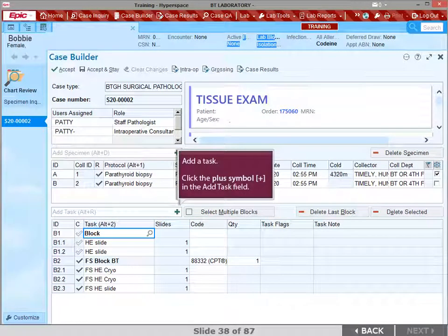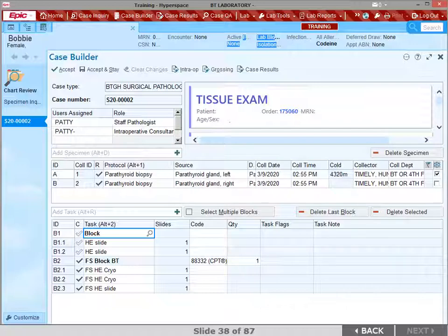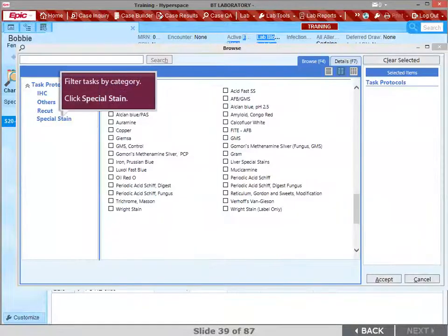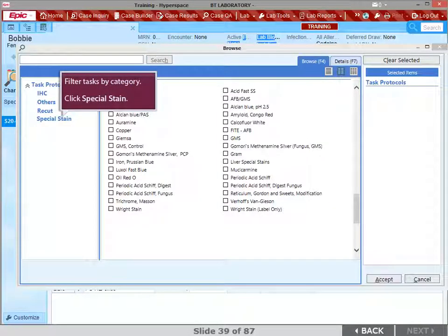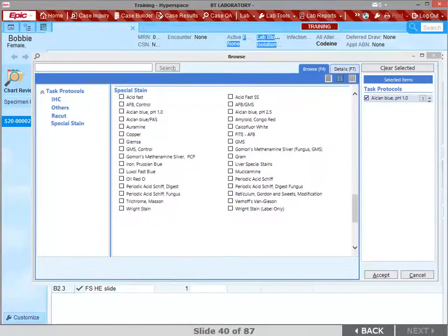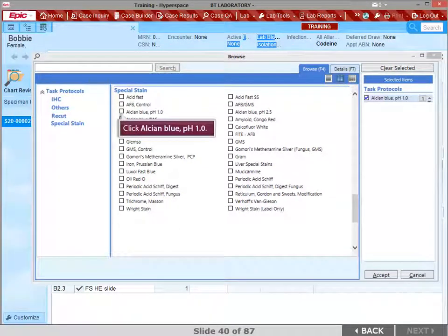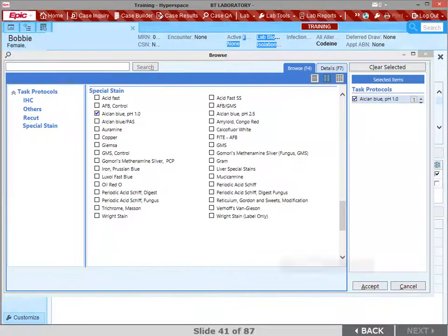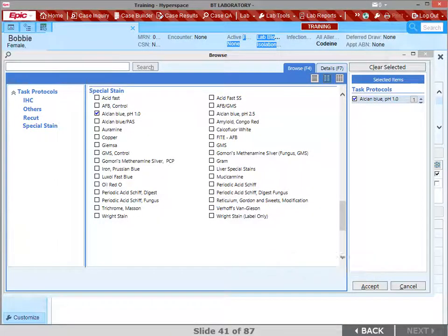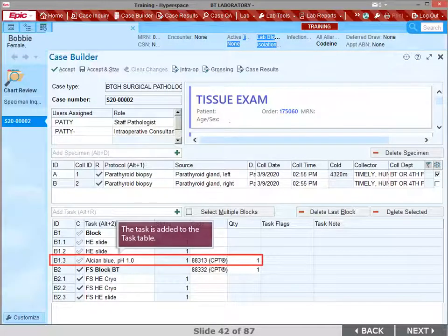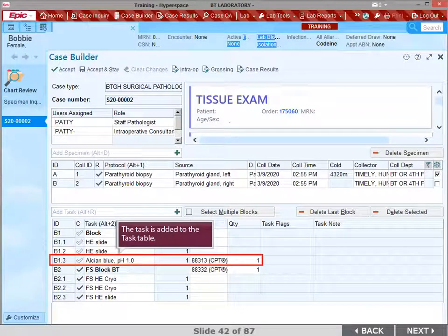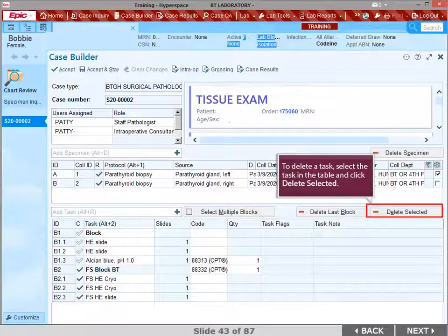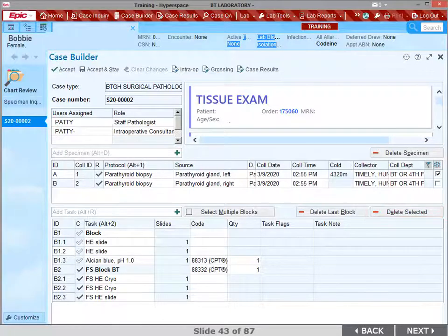You can filter the list of tasks by category. Click Special Stain. Click Alcian Blue, pH 1.0. Click Accept. The task is added to the task table for specimen B. To delete a task, select the task in the table and click Delete Selected.